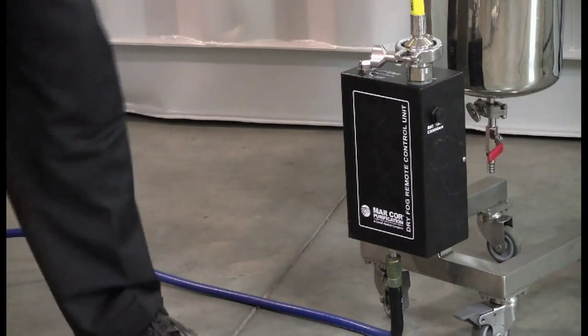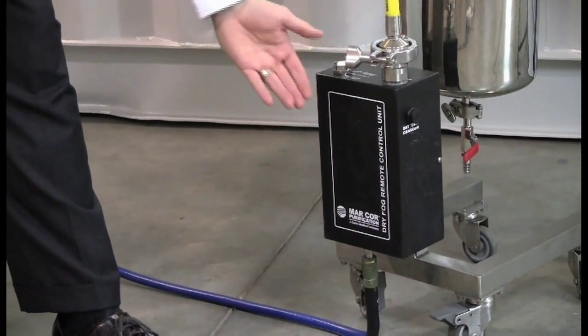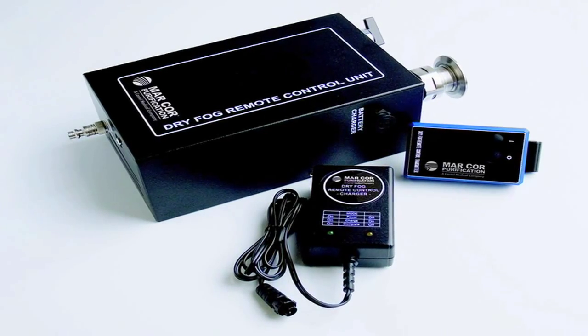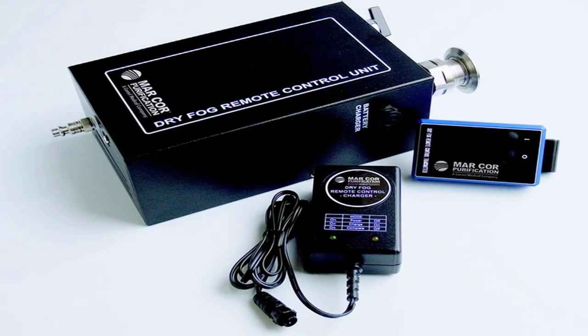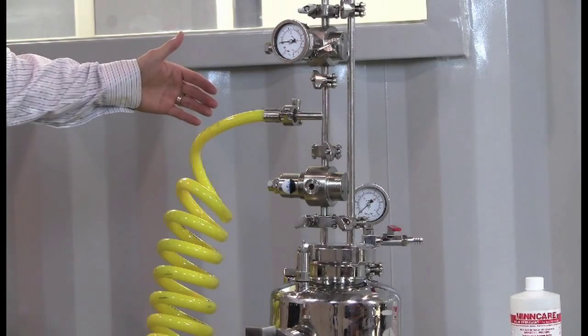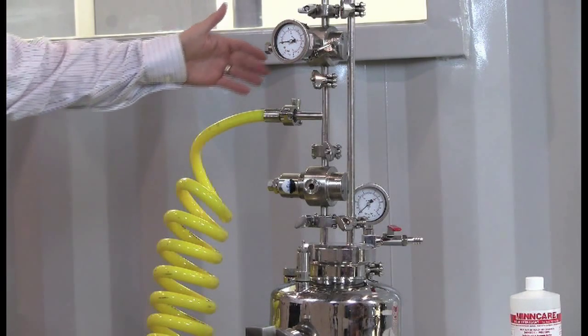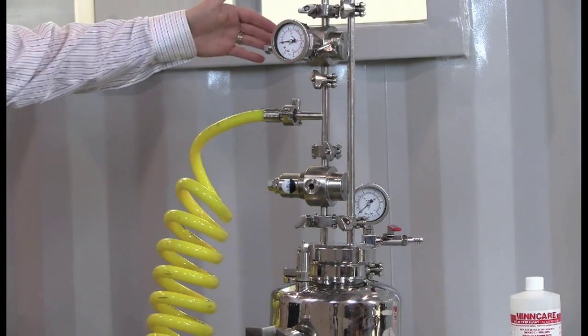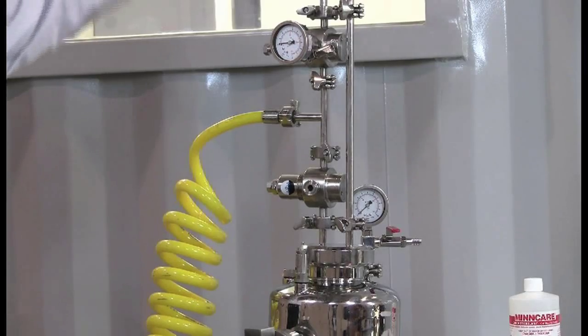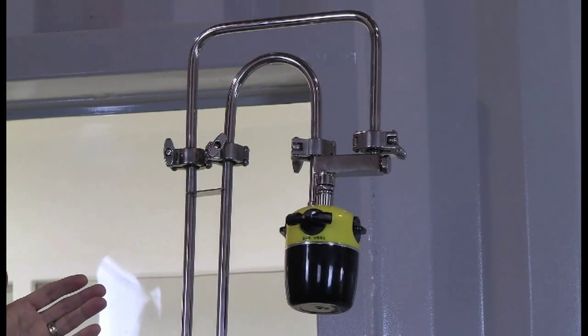Just to describe all the components of the unit, compressed air comes in the bottom of the dry fog remote. The dry fog remote turns on and off with this remote control when you're outside the clean room, allowing you to operate it and not be in the clean area. Compressed air connection to the dry fog unit. Pressure gauges and regulators regulating the compressed air to the tank as well as to the head.